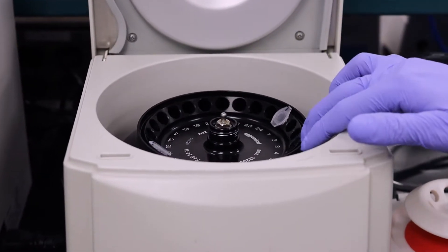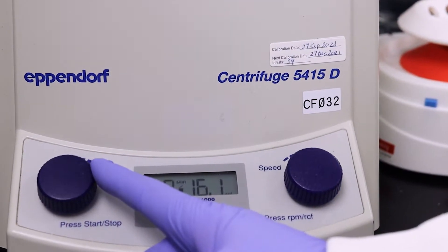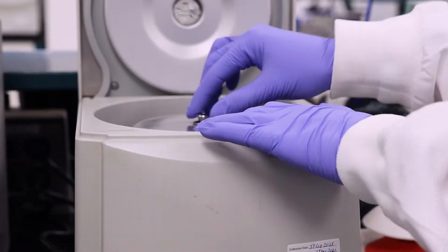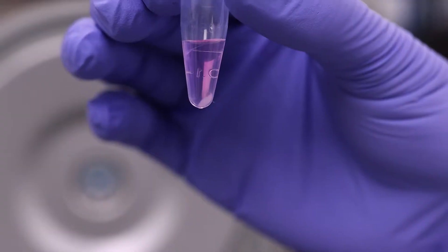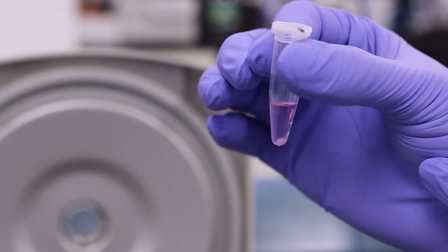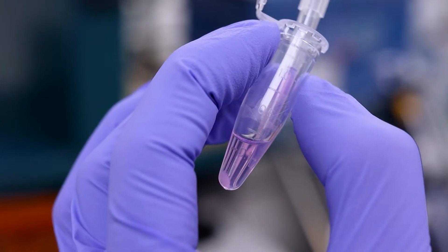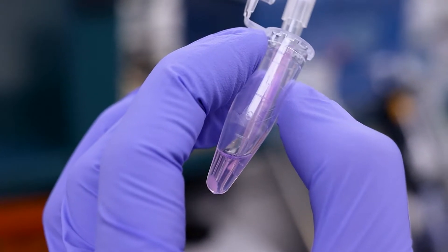Spin the lysate for 10 minutes at maximum speed in a benchtop centrifuge. Using a pipette with a small tip, transfer the supernatant containing the cytoplasmic RNA to another RNase-free tube.